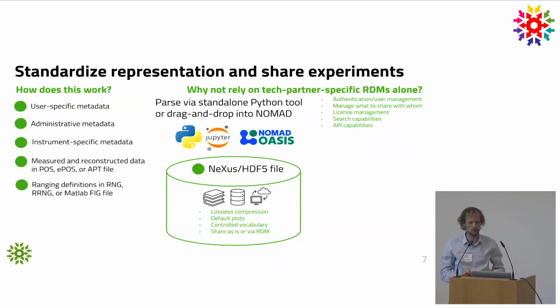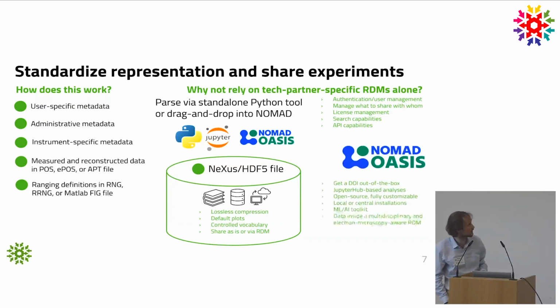Now you might say, why do I need such a system at all? Because a company like Cameca already provides commercial software where all of these laboratory management capabilities for their instruments are perfectly implemented, and that's in fact what most people use. I'm not convinced that this is a good argument. There is some truth in this argumentation, but it's rather a question of habit. And if you make such an argumentation, you also have to be honest to yourself. Do you really factor in everything that a solution like a specific research data management system, for instance NOMAD Oasis, can give you?